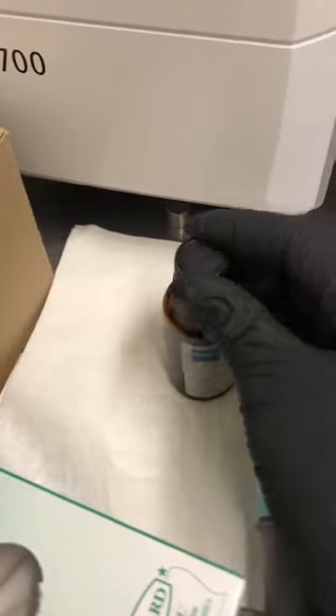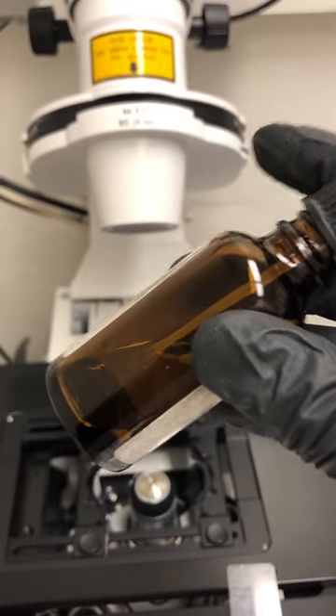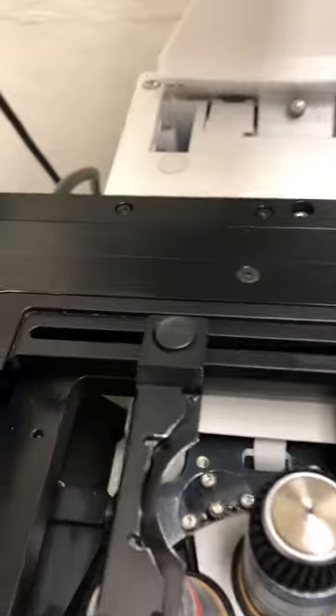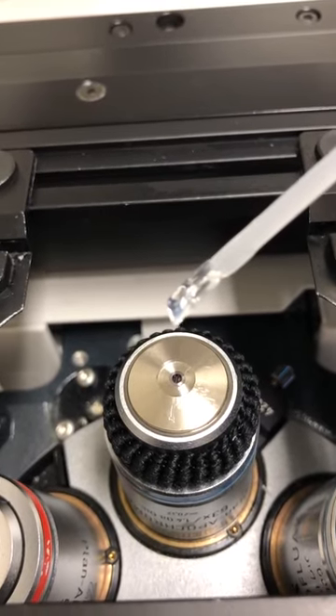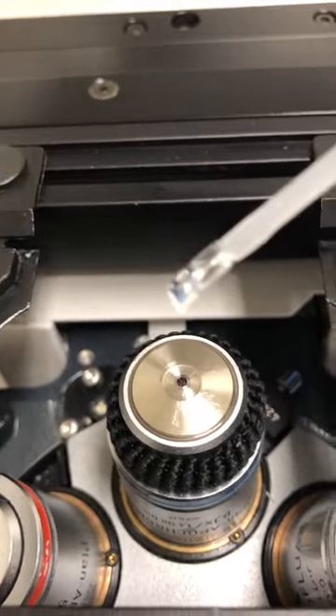To put oil on it, I'm going to use this oil. We don't really keep these oil bottles with a lot of oil in them, so I'm going to dip the plastic spatula into the oil - you can see it there. We don't need a lot of oil, so I'm going to take it and gently touch it to the front face of the objective. That's all we need - this is actually on the high side; you can even use less than that.